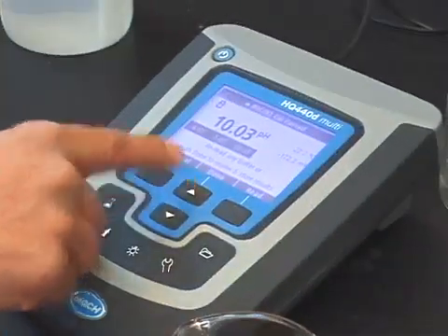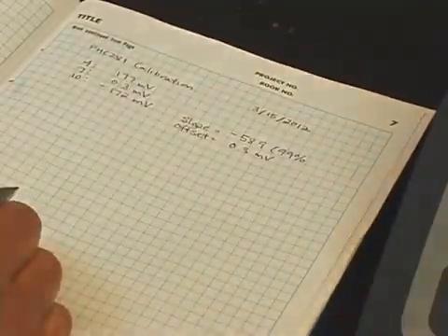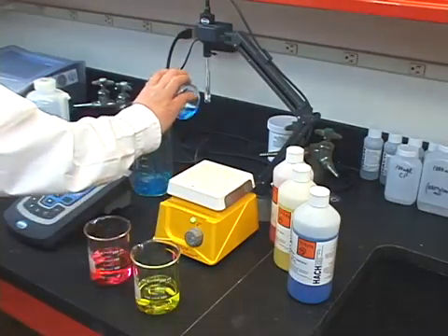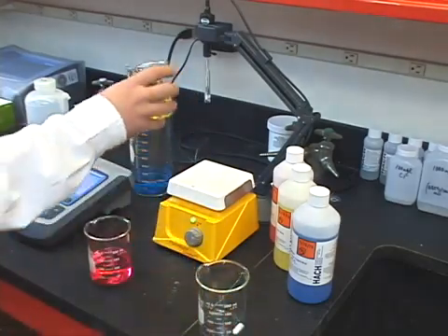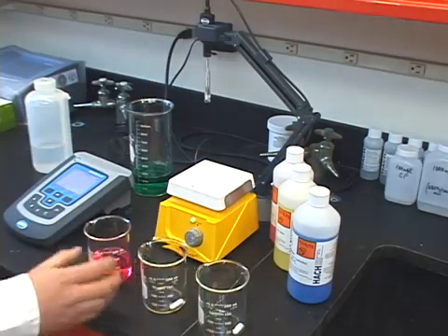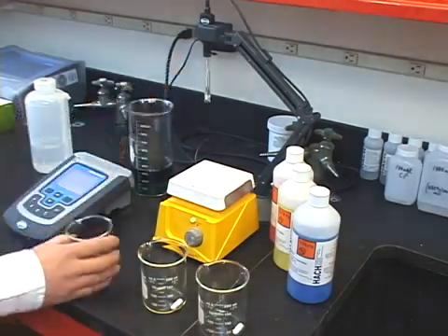Once you have all of your calibration readings, you can record the slope, time, and temperature of the sequence. When you're finished, do not pour used buffer back into the original container, as this will contaminate your buffer solution. Each time you need to calibrate, new buffers should be used. Remember, buffers are inexpensive, but errors introduced to your measurement are not. Now that you have calibrated your meter, it is time to take your measurement.